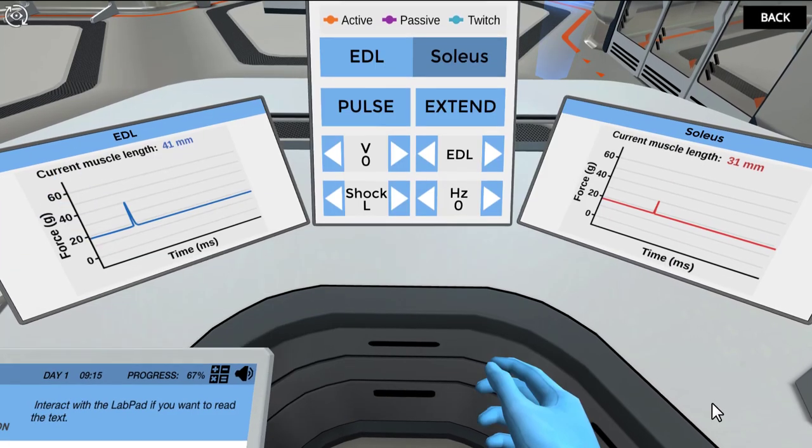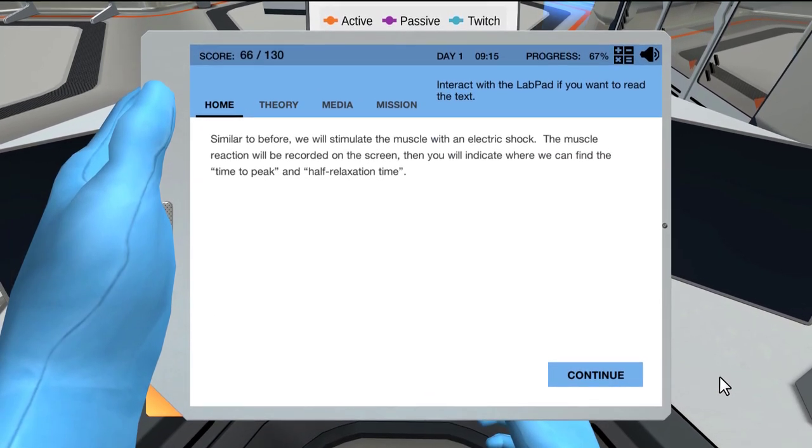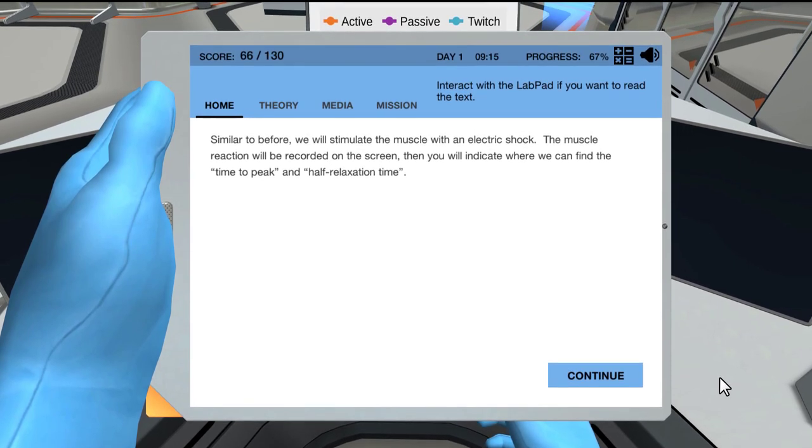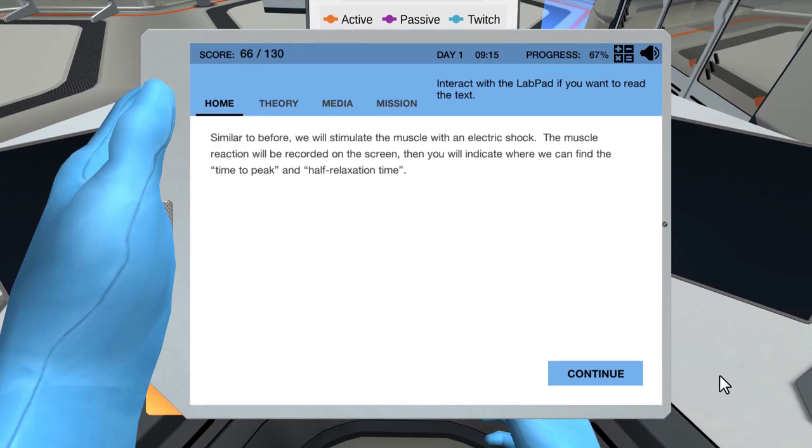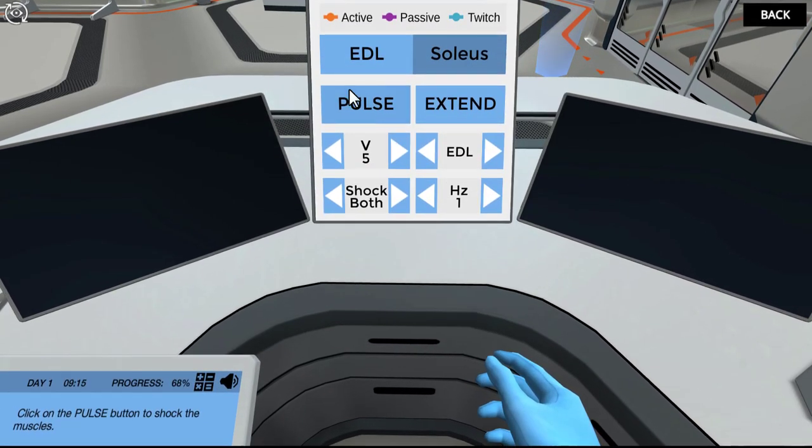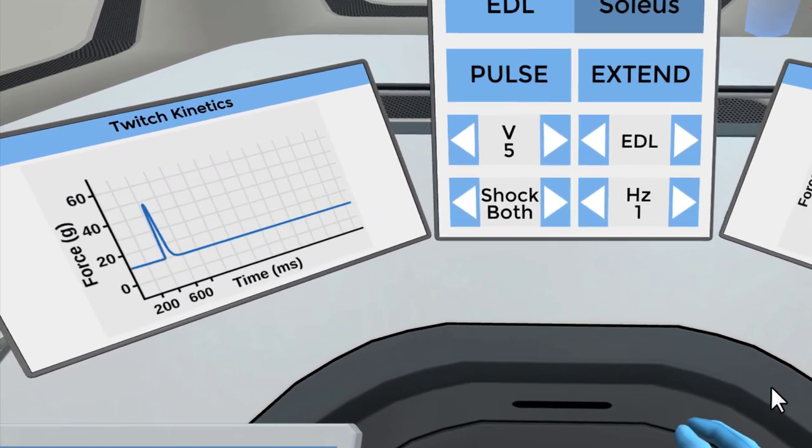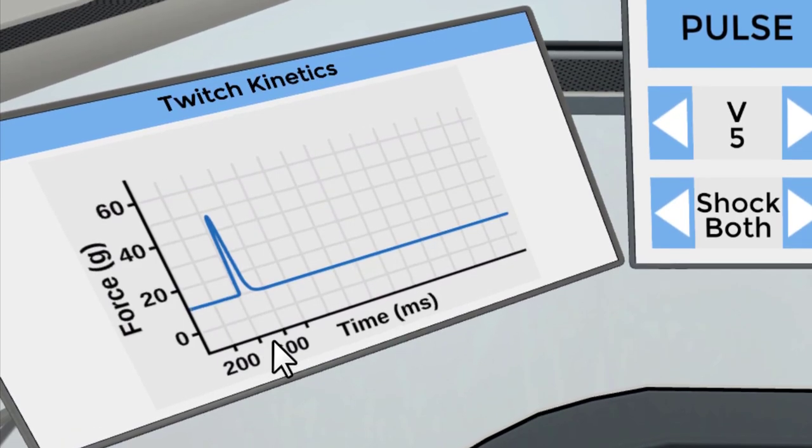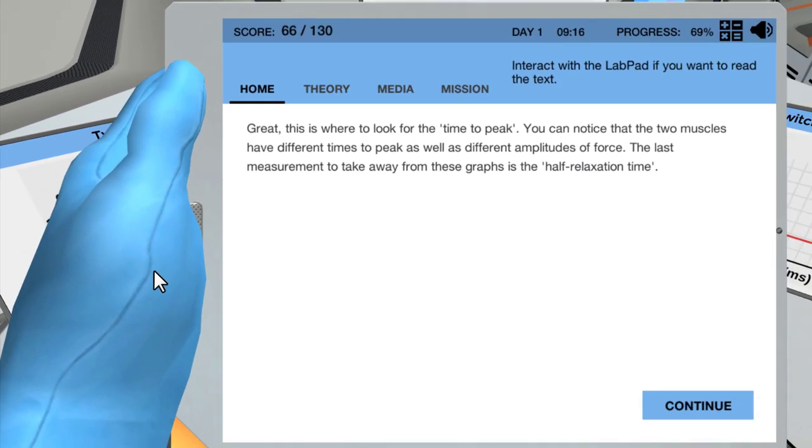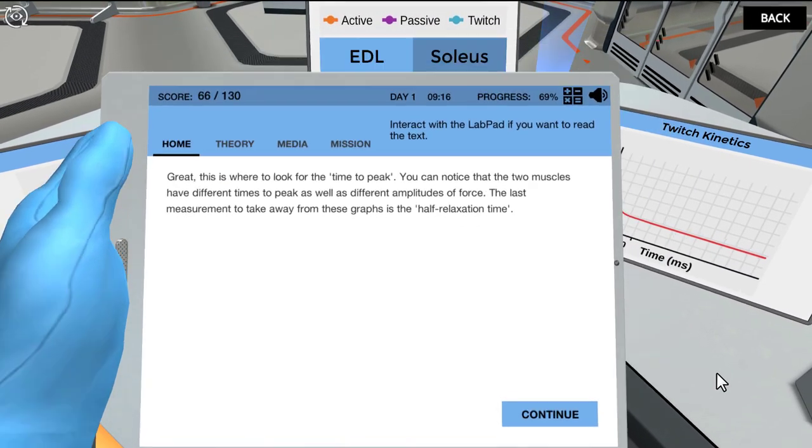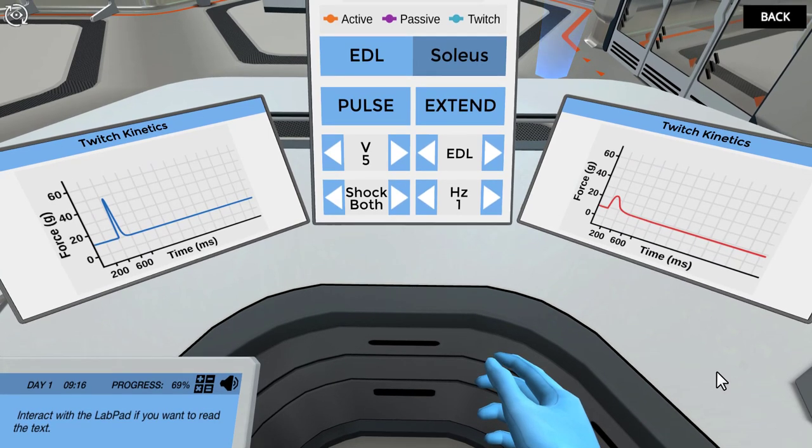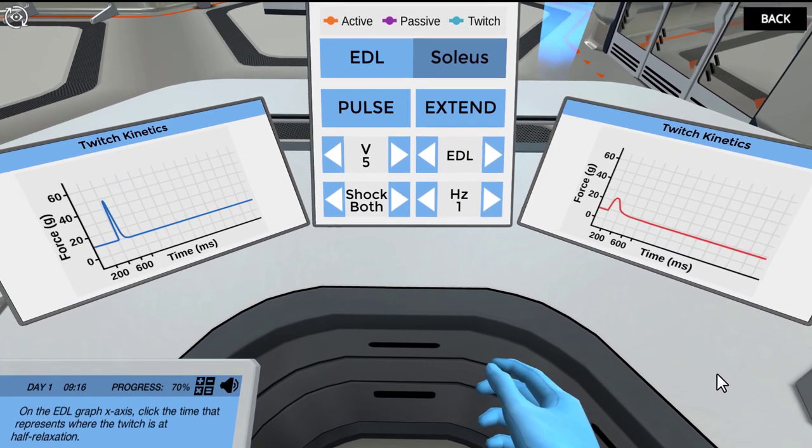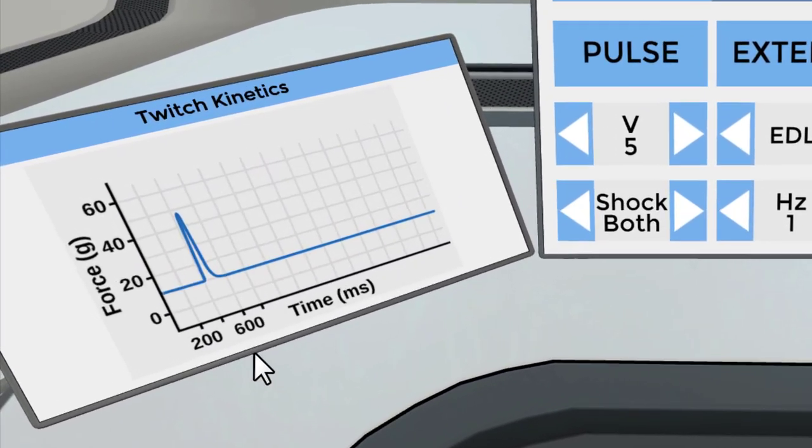Now you know how the length of a muscle affects its performance. It's time for some twitch kinetics. Similar to before, we will stimulate the muscle with an electric shock. The muscle reaction will be recorded on the screen, then you will indicate where we can find the time to peak and half relaxation time. Click on the pulse button to shock the muscles. On the EDL graph x-axis, click the time that represents where the twitch starts. Click on the x-axis where the twitch peaks. Great, this is where to look for the time to peak. You can notice that the two muscles have different times to peak as well as different amplitudes of force. The last measurement to take away from these graphs is the half relaxation time. On the EDL graph x-axis, click the time that represents where the twitch is at half relaxation.